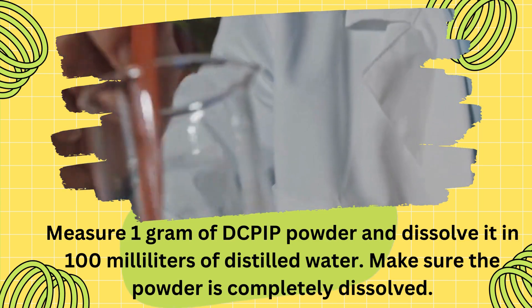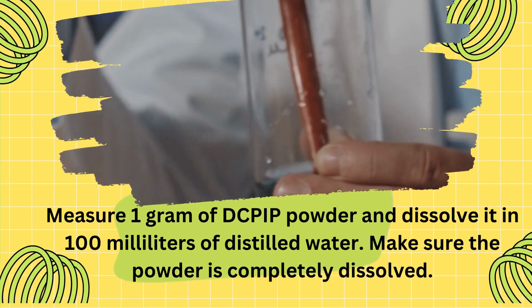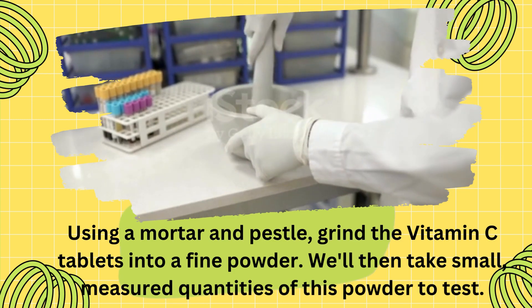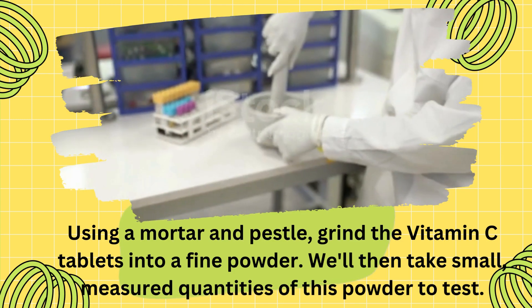Once your DCPIP solution is ready, it's time to prepare our vitamin C samples. Using a mortar and pestle, grind the vitamin C tablets into a fine powder. We'll then take small, measured quantities of this powder to test.